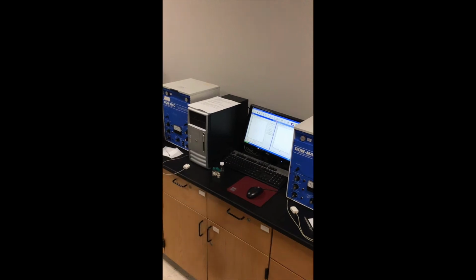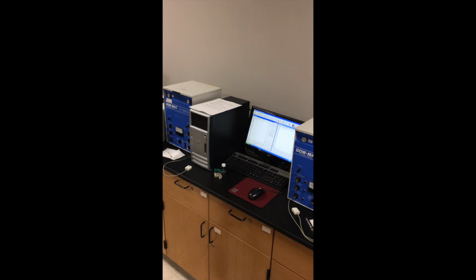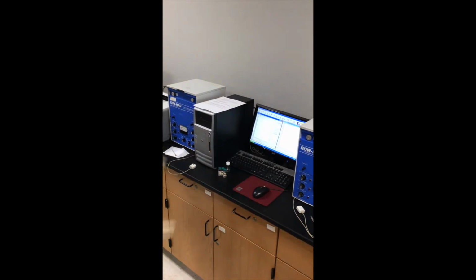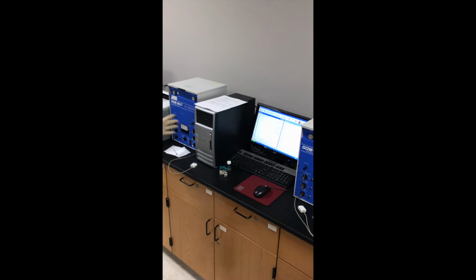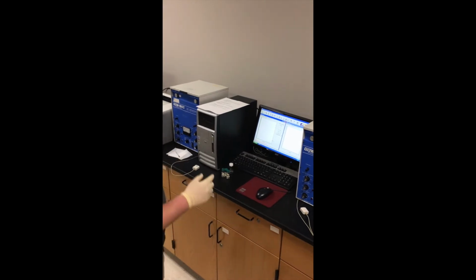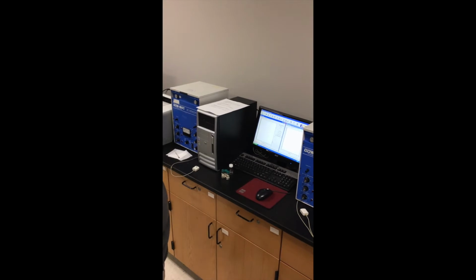This week in organic chemistry, you're going to be working with the gas chromatograph, or the GC, as most people call it, so it's not as long. In this room we have 4 individual chromatographs, but because of COVID, we're going to spread out, or at least I think we are. Each one is technically equipped to do 2 things at a time. You could have 2 people work on either side of the injectors, but most of the time we have 1 injector for each, just for simplicity's sake, I suppose.